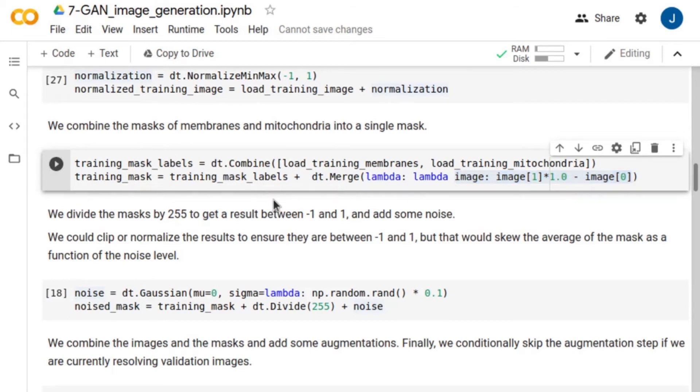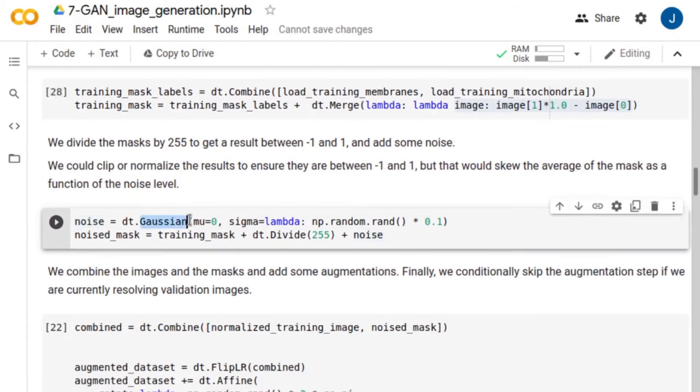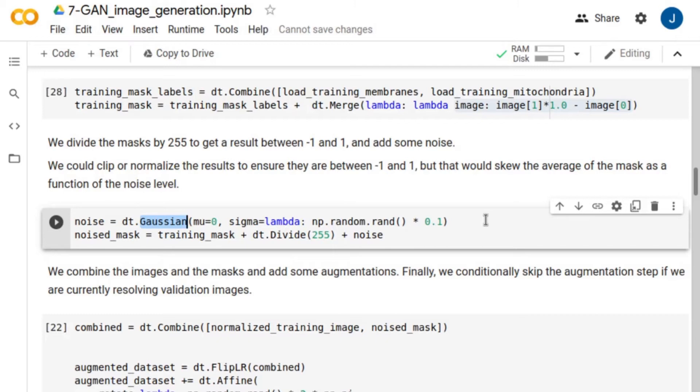We add a random Gaussian noise with a standard deviation ranging between 0 and 0.1. We noticed that adding noise improved the quality of the generated images significantly. The value for the standard deviation is completely up to you and depends on your application.